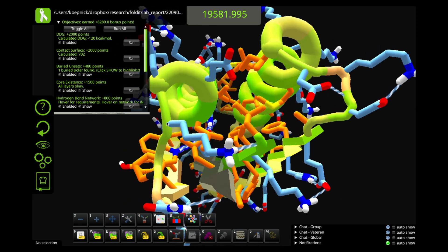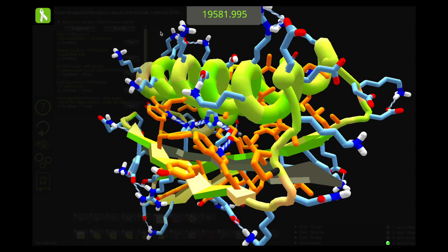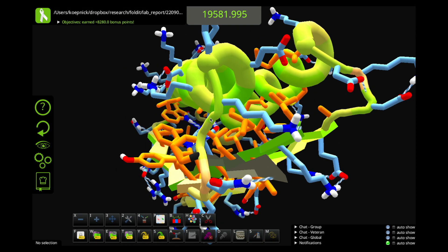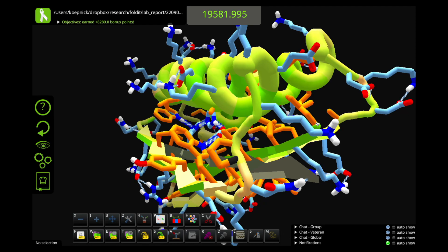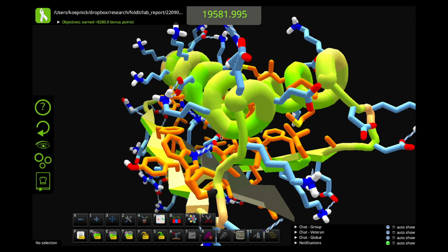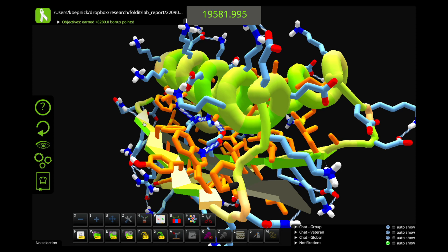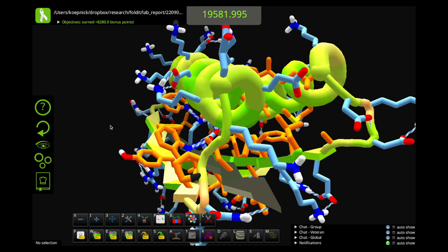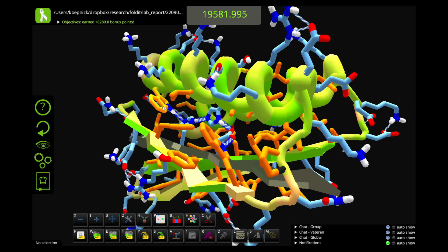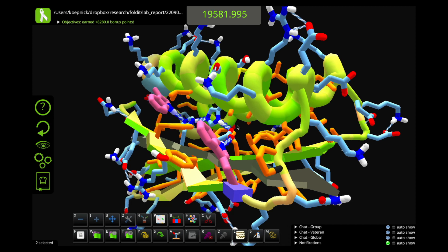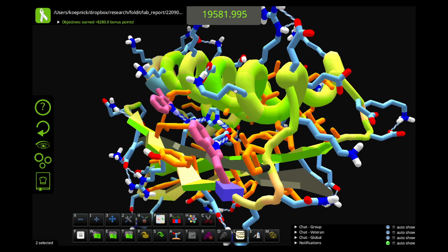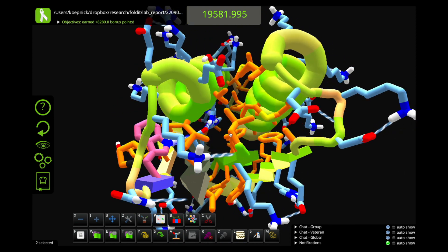The other thing I like about this design is that it has lots of hydrophobics on the edge strands. Sometimes Foldit will like to put blue polar residues all along these edge strands, even on both sides of this beta strand. And that can cause some problems. Normally, if you have a lot of blue polar residues in a sequence without any orange hydrophobics, those sequences will tend to be disordered. They won't fold up. But this is nice, especially these two tryptophans here on the end, which contribute to this hydrogen bond network, still present lots of hydrophobic packing, which will help keep this protein folded in a rigid, well-folded form.